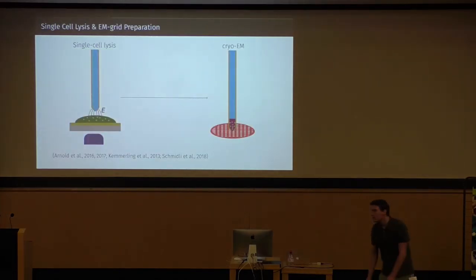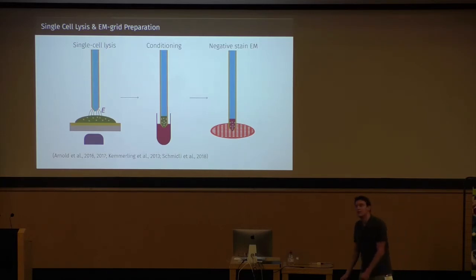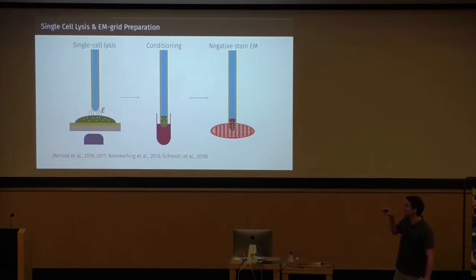Then to the single cell part. As I mentioned in the beginning, we are able to grow, monitor and lyse single cells in our setup and prepare the lysate for cryo-EM as well as for negative stain EM. The lysis is done by electroporation, which works as follows. The cells are grown on ITO-coated glass slides, so electrically conducting glass slides which are grounded. The electric field is generated by a function generator which is connected to this platinum-coated capillary. After this electroporation, the cell is immediately withdrawn into the capillary, and by the present shear force it is lysed completely.